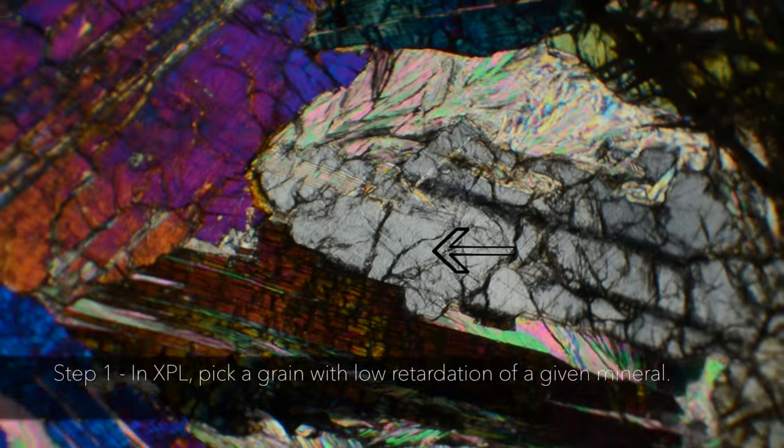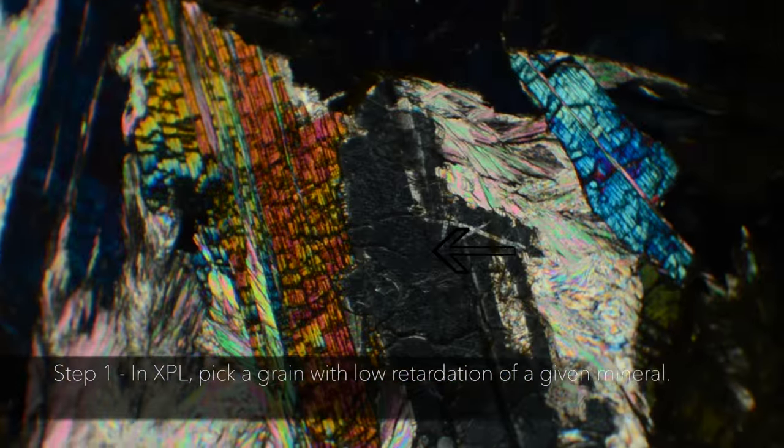Step 1. In cross-polarized light, pick a grain with low retardation of a given mineral.